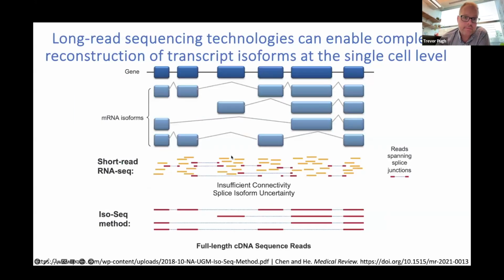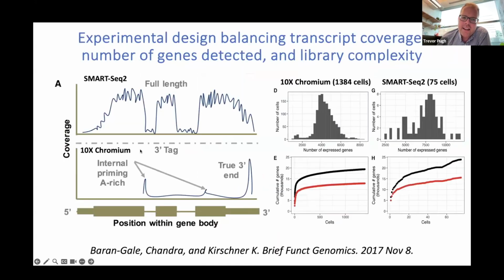I'm going to hop in here with a question from the Slack. How can we get full-length capture in SMART-seq2 when we still use Illumina machines? Are they not still short reads? It's actually a great segue to this exact slide, which is actually from PacBio, where you do have complete transcript information. You can still get short read information from SMART-seq2 because you are still getting reads across the entire transcript. The way SMART-seq2 works, it amplifies the whole transcript and then it gets fragmented. But you can still count up the number of reads that map to each of the exons.